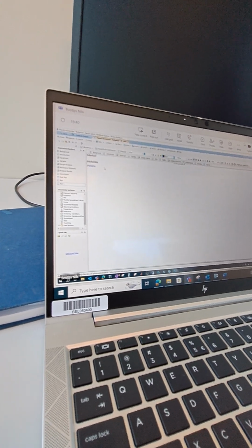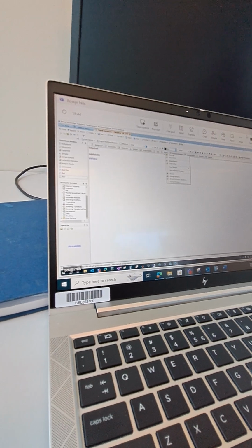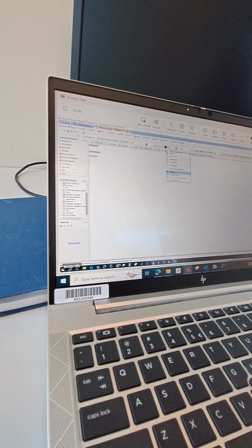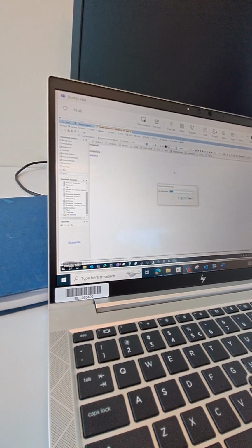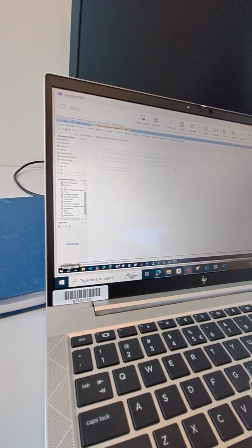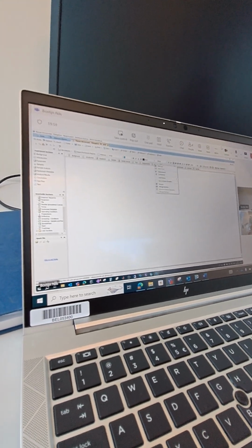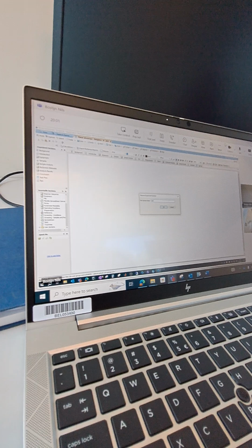Basic stuff. So you can also change the name. If you right click on it here on the tab, you can do rename. You can say measurements, for example, and then you can add a second text section with data analysis.